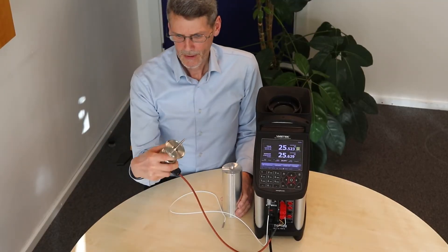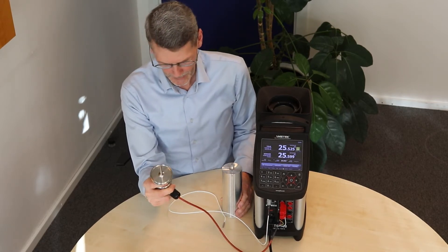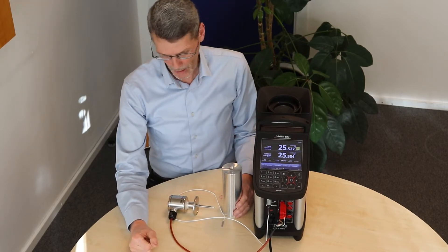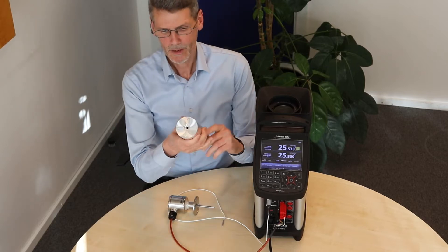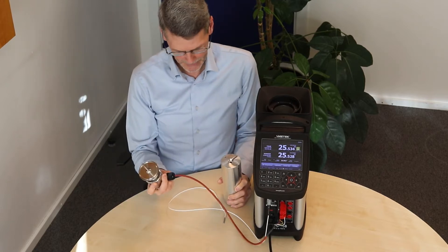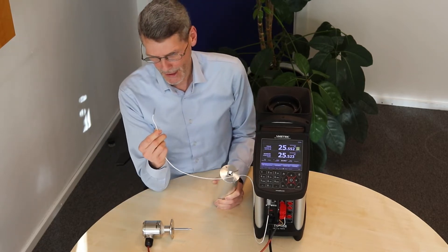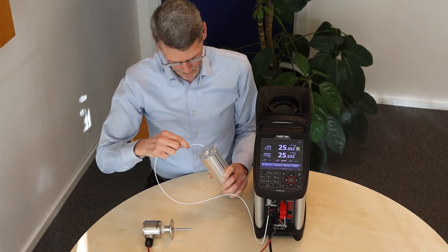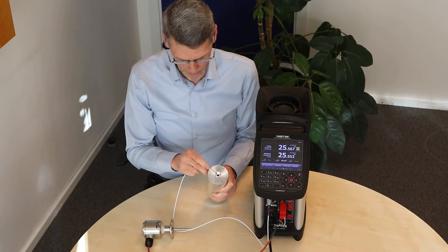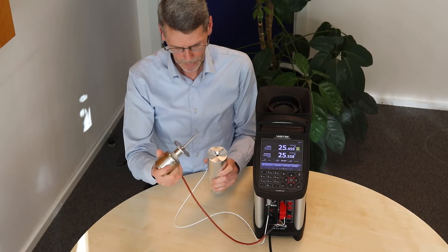Method number one: calibration of a sanitary sensor in a special drilled insert. This is the easiest and fastest way to calibrate a sanitary sensor dry. What you need is a special drilled insert to fit the sanitary sensor. And naturally we also need to use our special designed reference sensor, which we mount in the special drilled insert. This is drilled so that the depth of the reference sensor and the sensor under test will be the same.